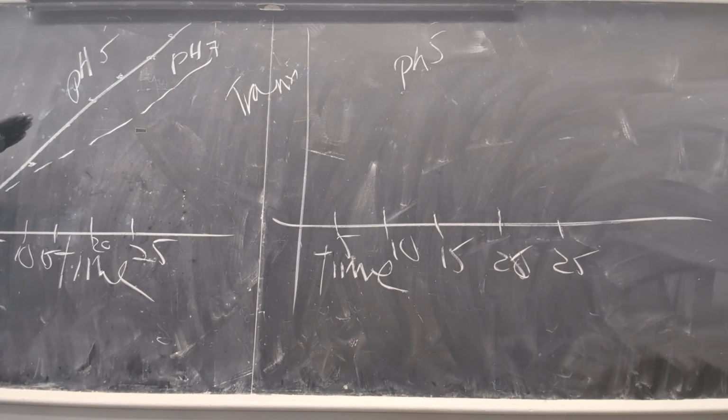That tells you at pH 5, our enzyme gave us more product than at pH 7. So here we have proven that there is more substance to absorb light at 15 minutes in test tube pH 5 than in pH 7. Does that make sense? Yes.